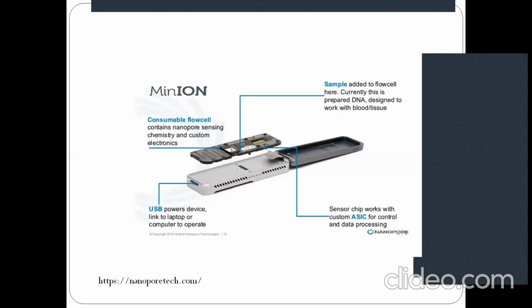You can also achieve paired end sequencing, which means you have double stranded DNA that is separated.